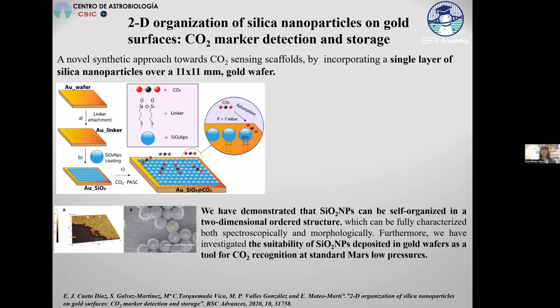If we move further to some other very different example, we have been studying 2D organization of silica particles on a gold surface in order to have a nanosensor for CO2 marker detection and storage. So it was a novel synthetic approach. We can see here how we were doing the procedure: the gold sample, then we put some attachments, some linker, and then the silica nanoparticles in order to have a self-organized two-dimensional ordered structure that we characterized spectroscopically and morphologically.